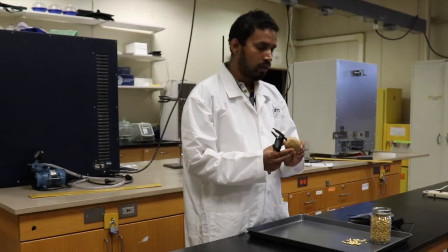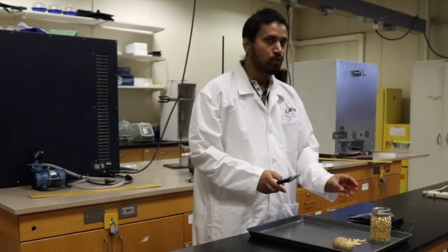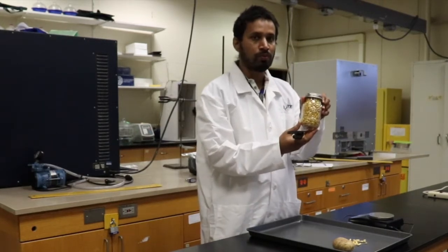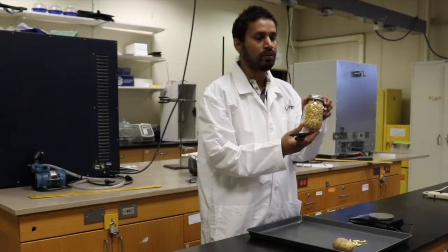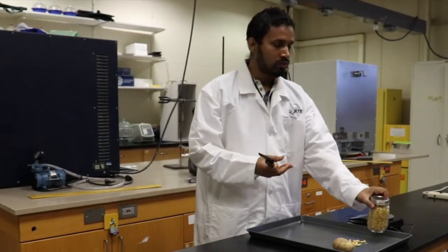In this video, we will learn how to measure the three dimensions of potato and corn kernels by simply using a caliper, and then use this information to correctly describe the shape and size of the potato and corn.